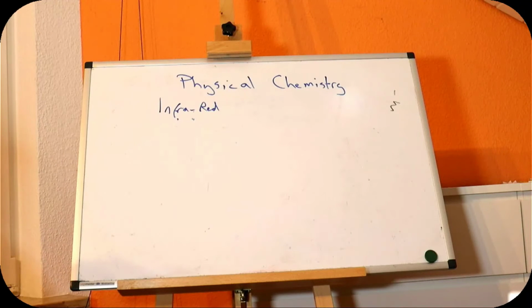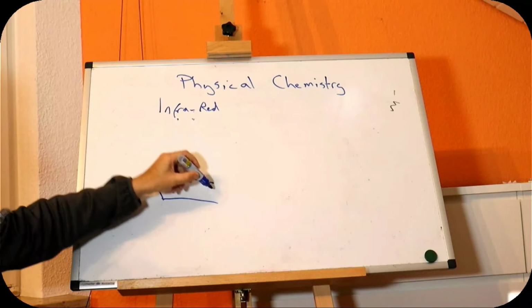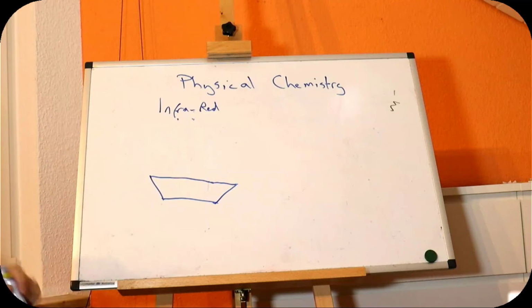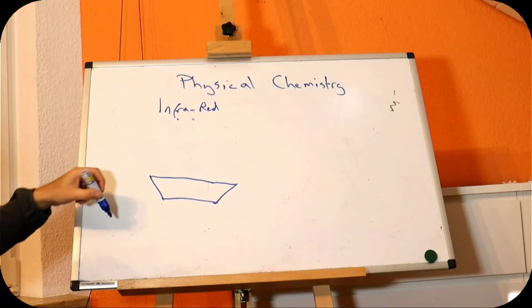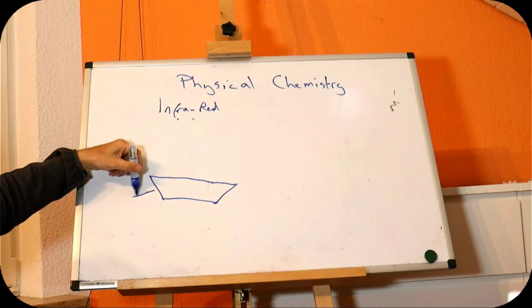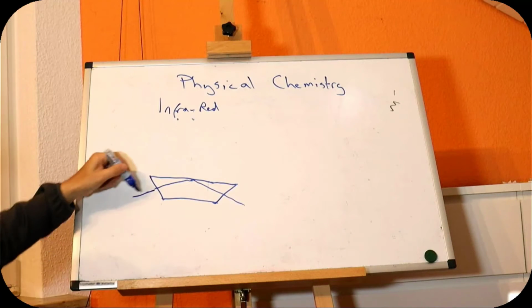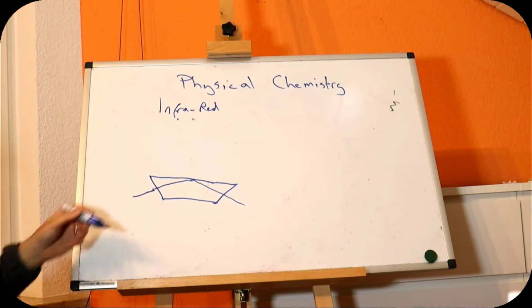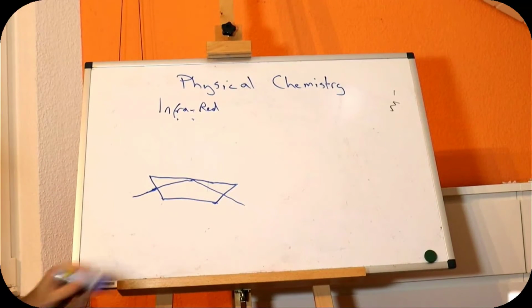So what we use here is a crystal, no, not a crystal, a piece of material, let's call it that, which traps the infrared light. The infrared light comes in at an angle, bounces off the top, and goes back out again. So I've tried to draw it so that this face is straight compared to the infrared beam coming in.